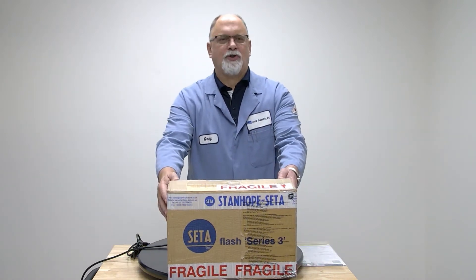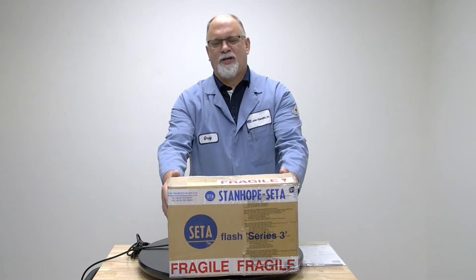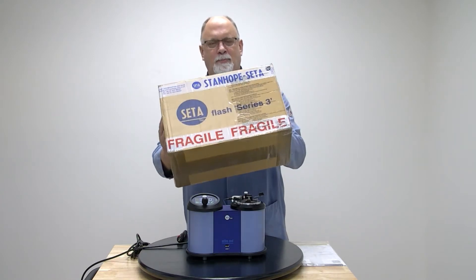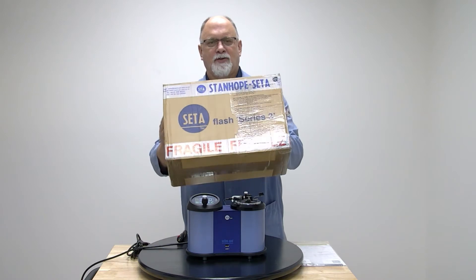Before taking your instrument out of the box, check the box to see if there's any sign of damage or holes. If there is, take pictures, notify us, and notify your shipping department so we can get a claim filed.